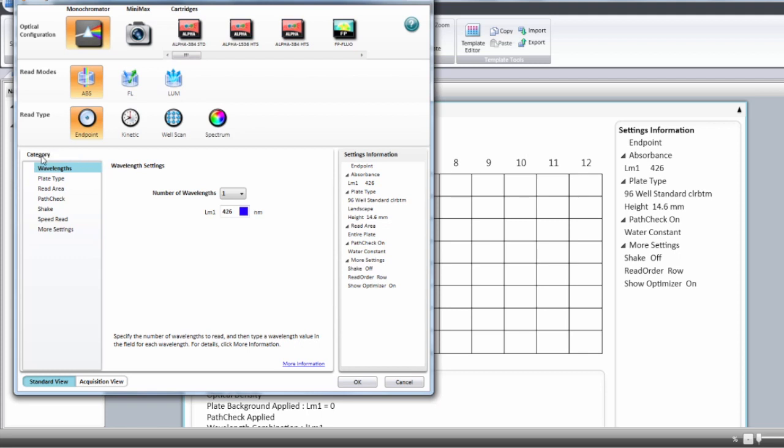Then you will have to follow the left side menu step by step. First the wavelengths. You can select from one to six wavelengths.